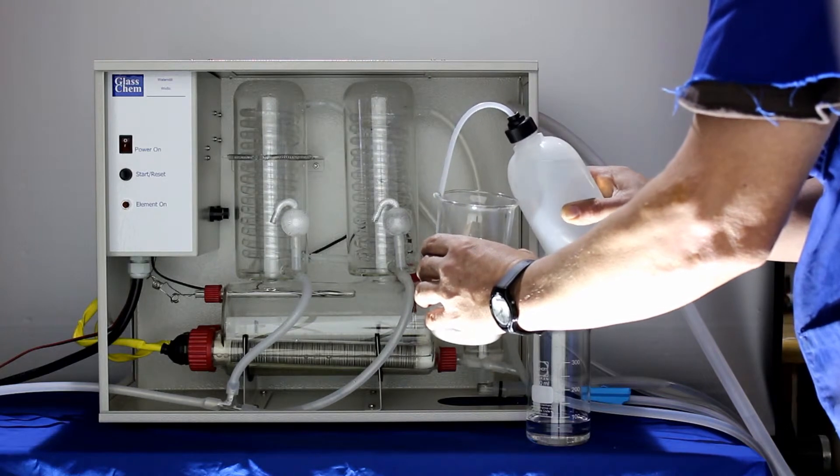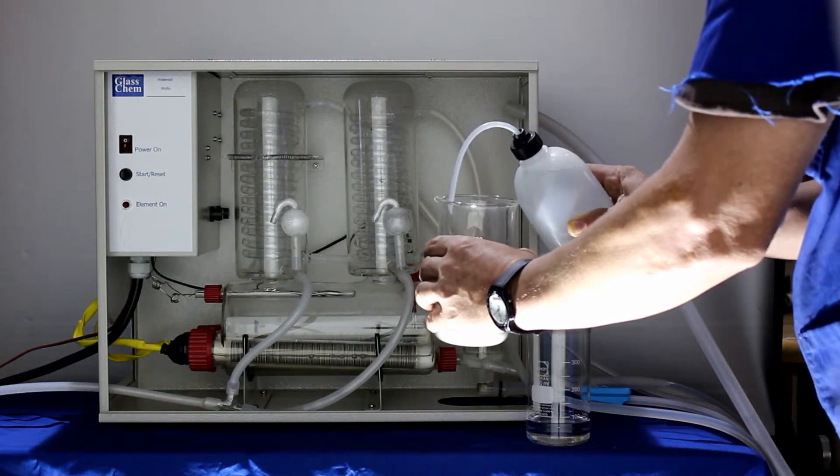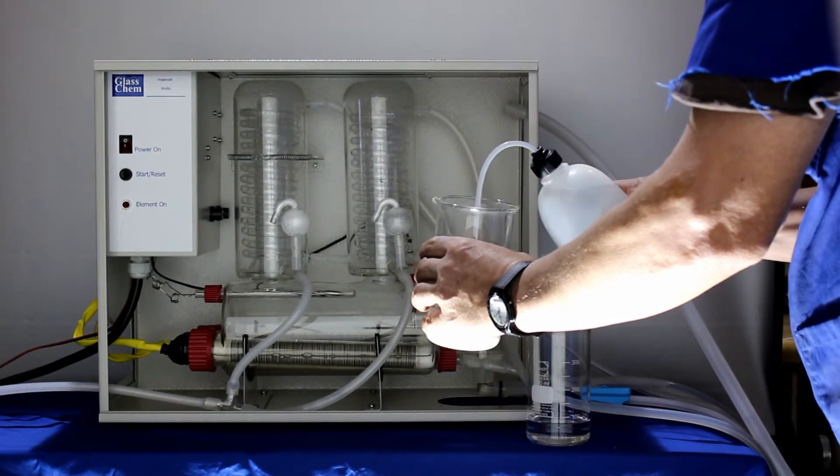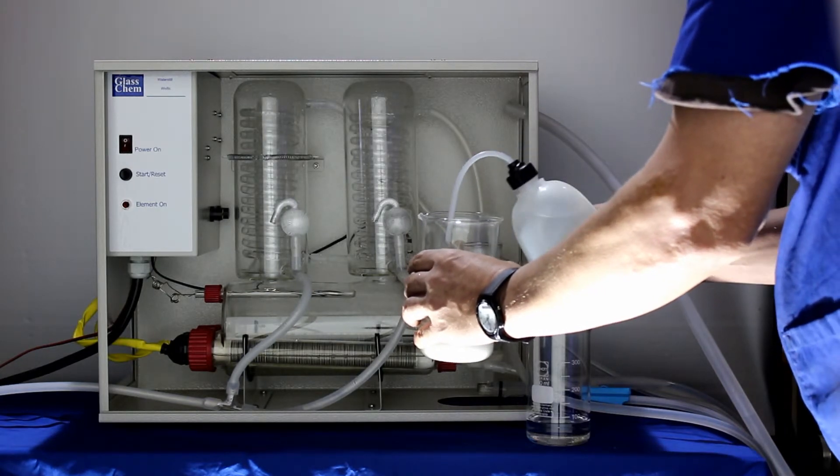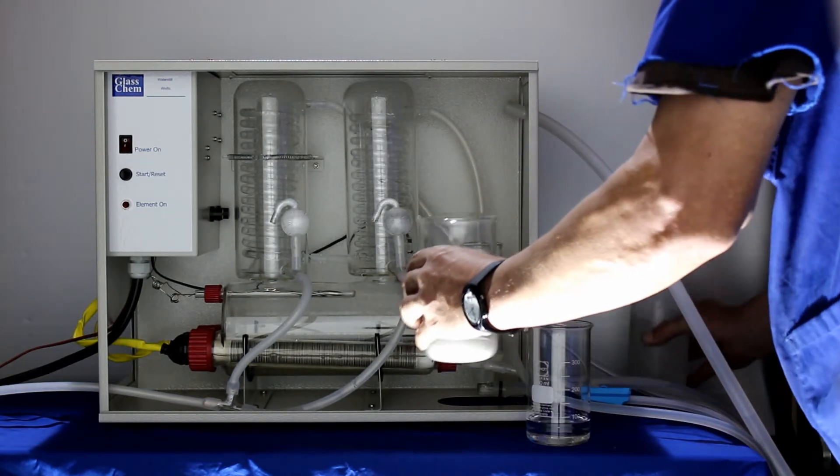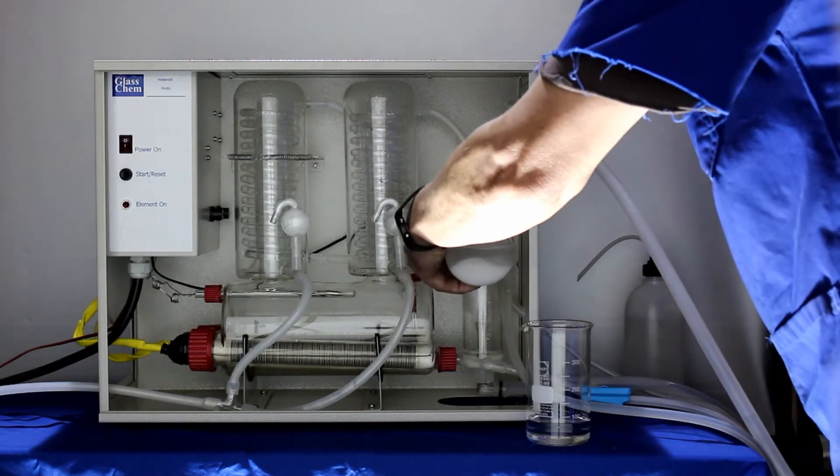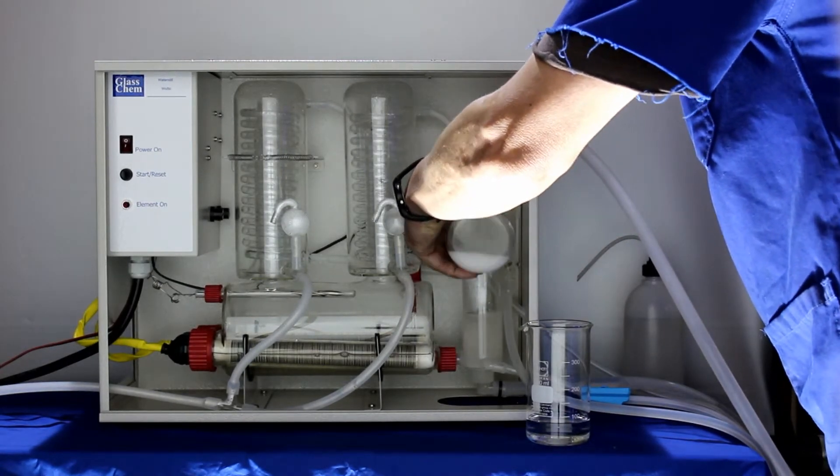Open the water supply valve and add water to the boiler. The water will rise up into the constant level device. Just make sure it does not drop out of the side. Add enough water to reach all the dirty areas inside the boiler.